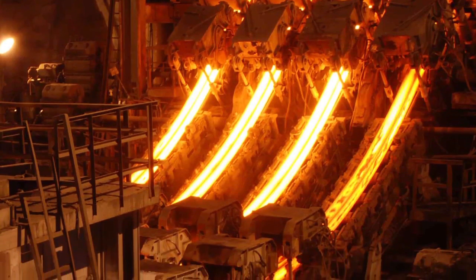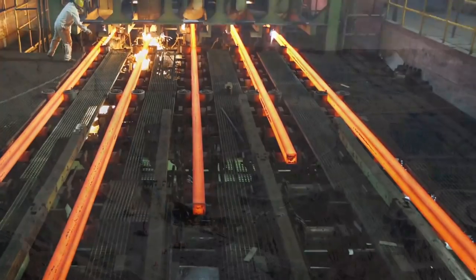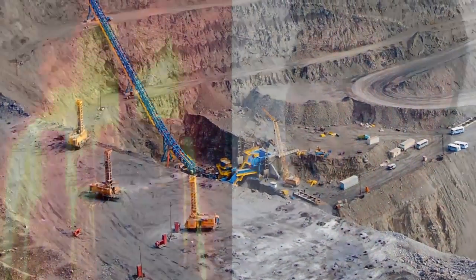This instrumentation works great in the harshest environments — environments that have temperature change, where it's dusty, and where there's a lot of vibration. But because of how well the S2 Ranger is built, it can withstand these conditions and still give you reliable results.